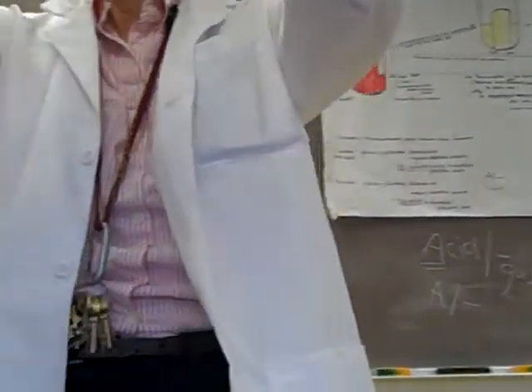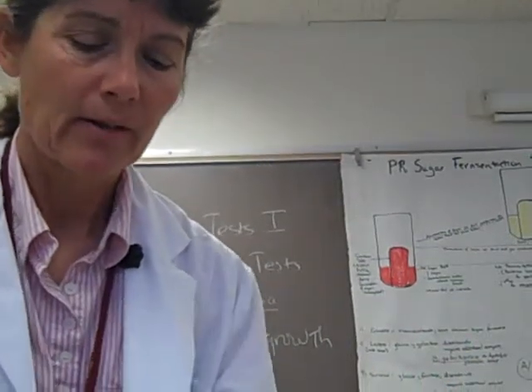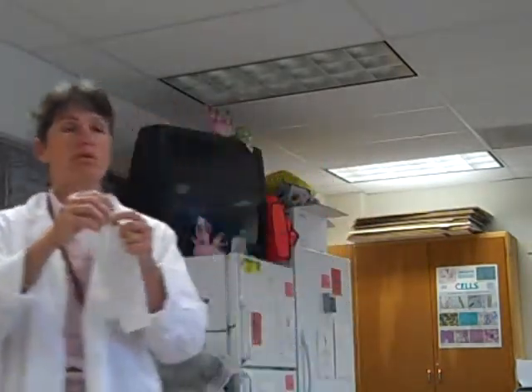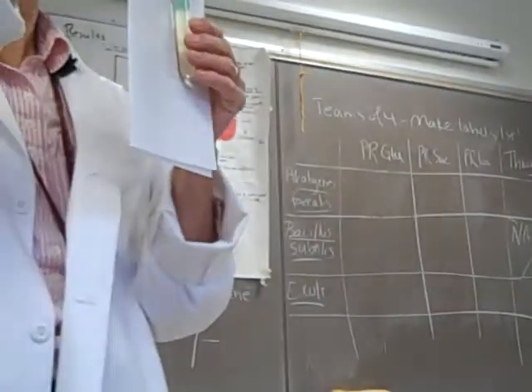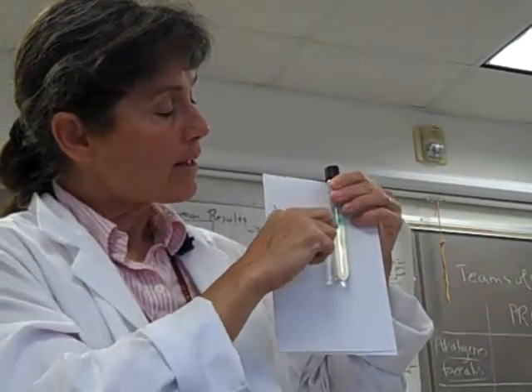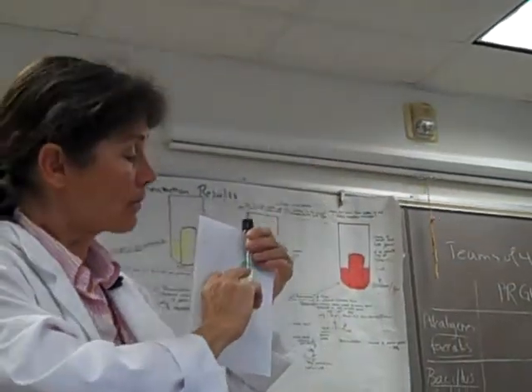So the thioglycolate media is up in the rack, and it's really important you don't shake it, you guys, and we'll explain why. This might ring a bell from lecture when we were describing microbial growth in chapter 6, and we were talking about microbes' relationship to oxygen. You might remember the diagram that showed the 4 different patterns of growth. Well, you now are going to run that experiment. Thioglycolate is a substance which reduces molecular oxygen and thus creates an anaerobic environment. You'll see in the media that the bottom portion of the tube has a slight yellow color. That's the anaerobic portion of the tube where the thioglycolate has reduced the molecular oxygen.